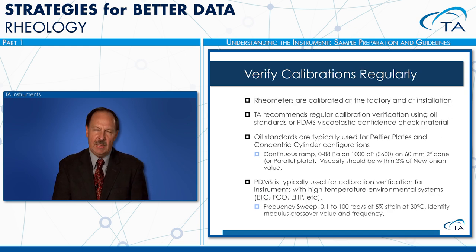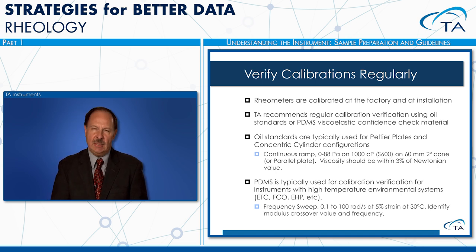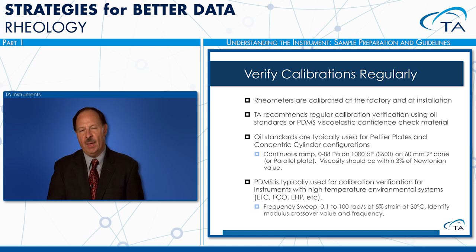Okay, it's a good idea to keep an eye on your rheometer to make sure that you are constantly getting good data. One of the features that we have here at TA is what's called the hotline, and perhaps some of you have called in to us and mentioned that you've had some questionable data. One of the things that we will most likely recommend is, have you run a viscosity standard lately? We want you to do calibrations, and we want you to do checks on standard materials at regular intervals. A lot of times we'd suggest monthly checks on your instrument, just so that you are confident that you're getting the best data you can on your rheometer.